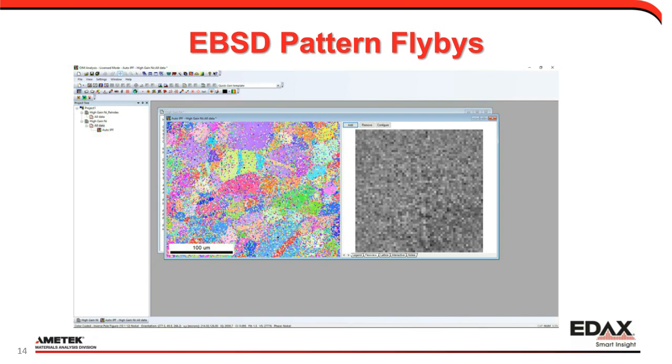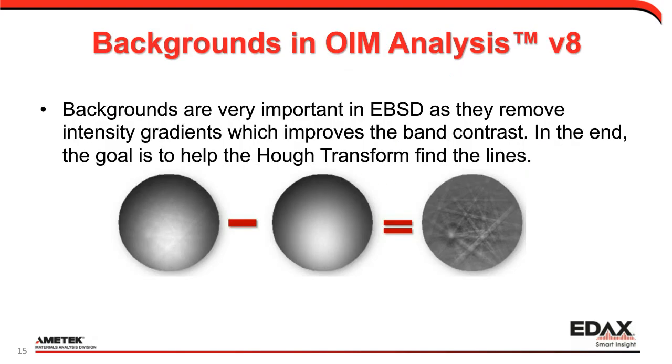And the reason we need to construct a background is twofold.